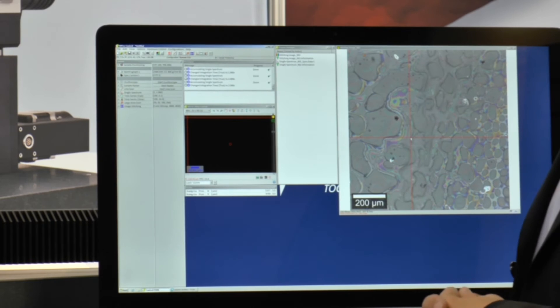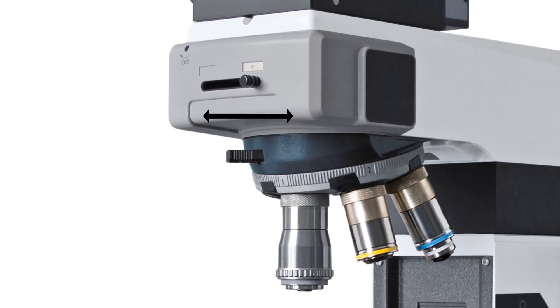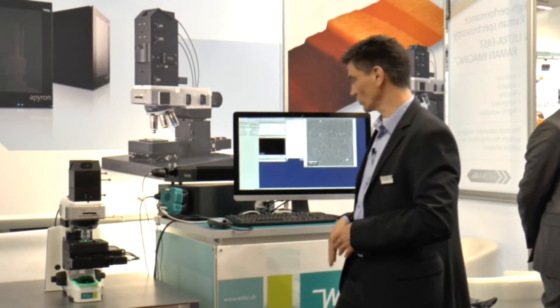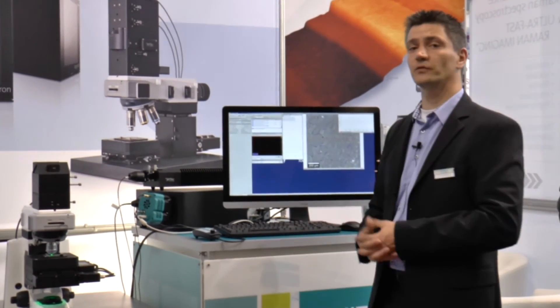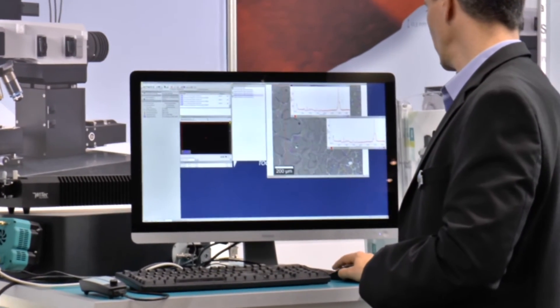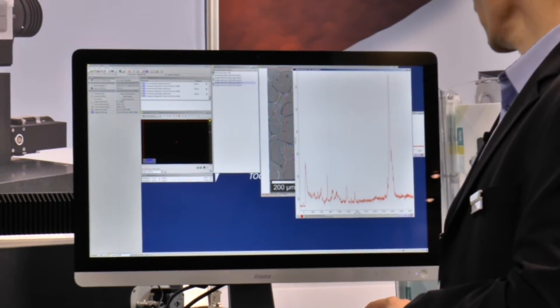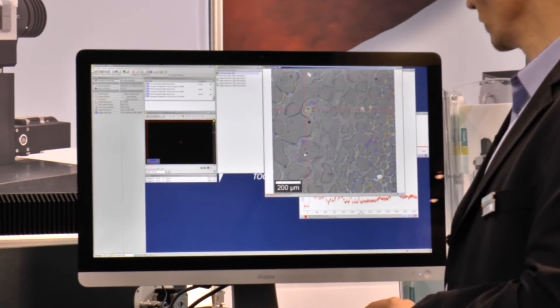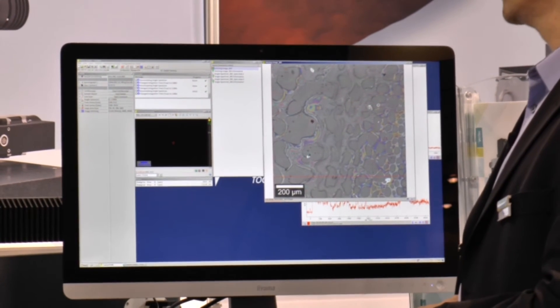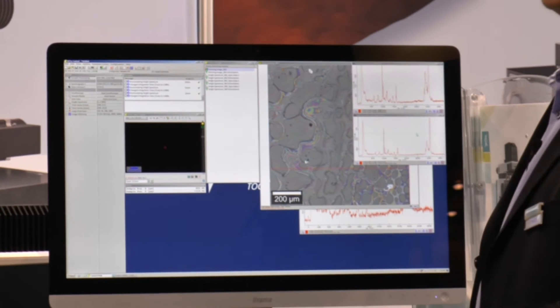Of course you can also take single spectra, which is what we're interested in with the Raman system. For this, I have to bring the white light illumination into the Raman position, take out the video camera, and open the laser shutter. Once the laser shutter is open, I simply click 'accumulate single spectrum'. With an integration time of 2 seconds we get the spectrum. PMMA is the material recorded at this position. Now let's click on another position — the rainbow-like structure. The system automatically moves there, and with 2 seconds integration time we see the very strong spectrum of polystyrene.